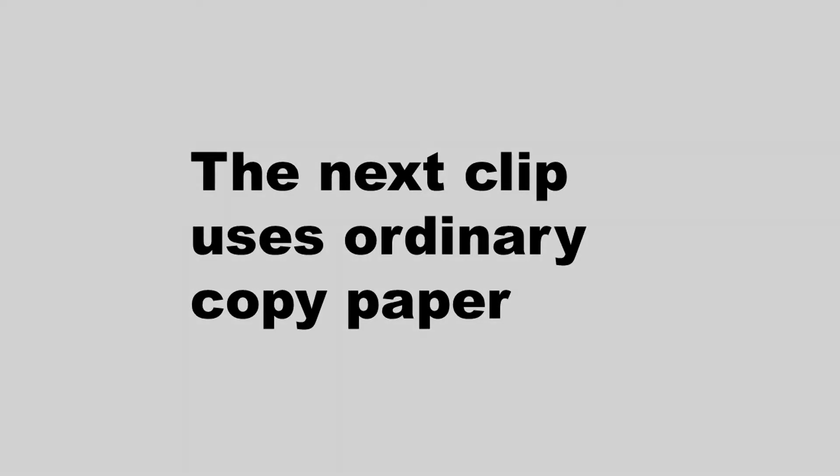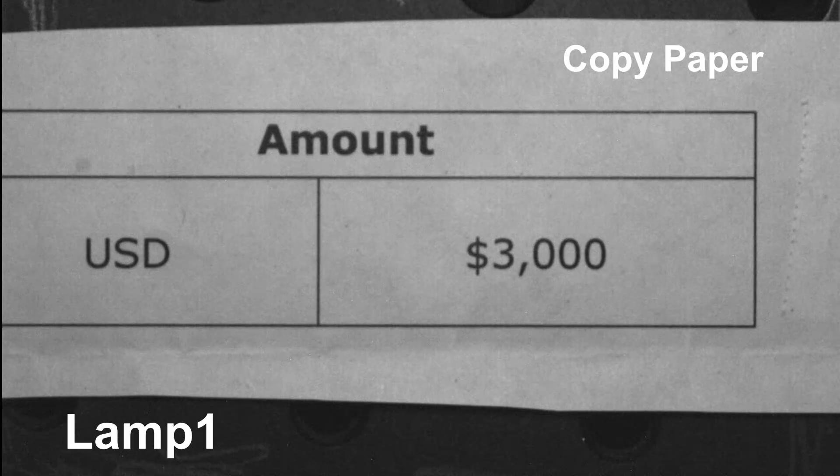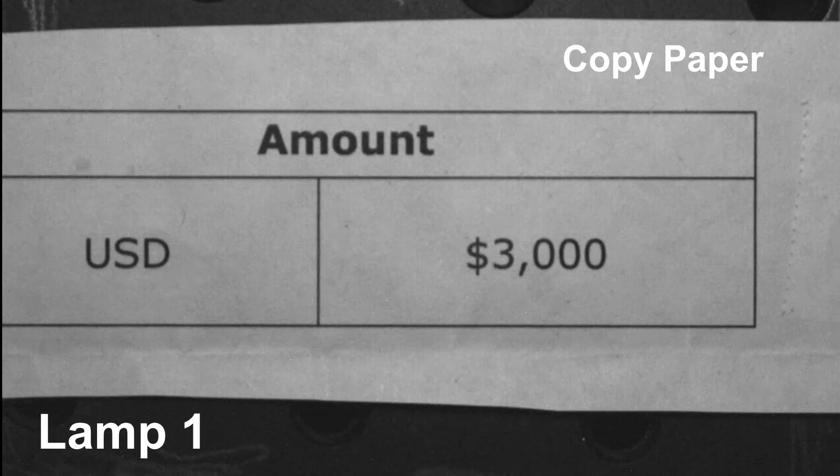The next clip uses ordinary copy paper. The paper is illuminated using lamp two to show there are no fingerprints. Lamp one is used when a fingerprint is applied to show that it is not visible. Lamp two is used to visualize that fingerprint, and some contamination in the paper is also visible. Using lamp one confirms that the fingerprint is indeed not visible.